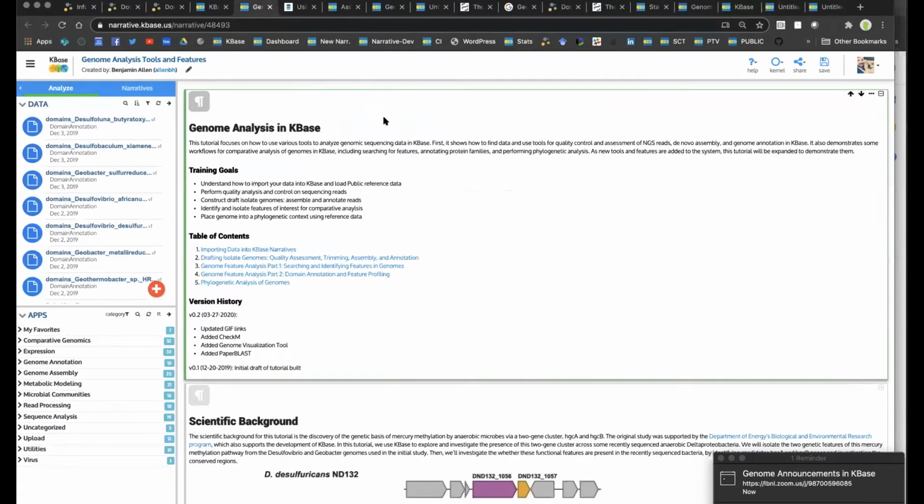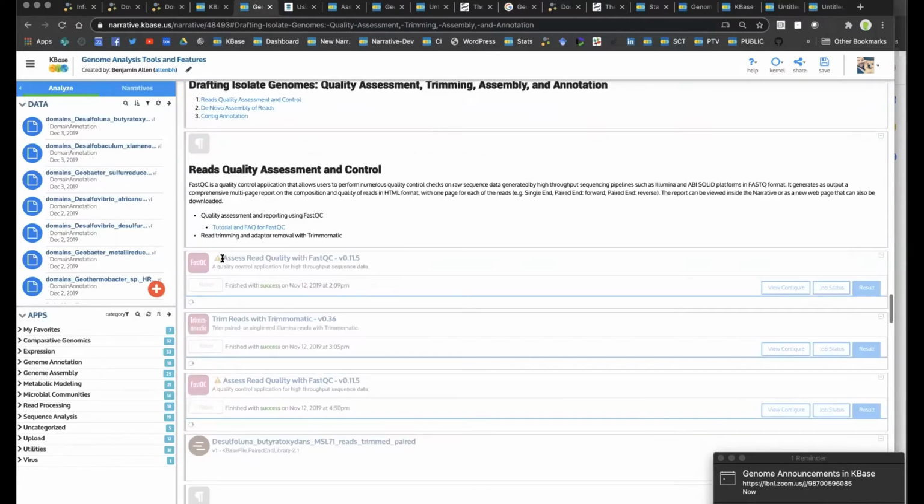This is a narrative that I have made to try to capture everything you can do at the level of genome analysis in KBase. I've done other webinars on this one, so I'm not going to talk too much about the content here, but I just want to draw attention to some of the content in number 2, in particular drafting isolate genomes: quality assessment, trimming, assembly, annotation.